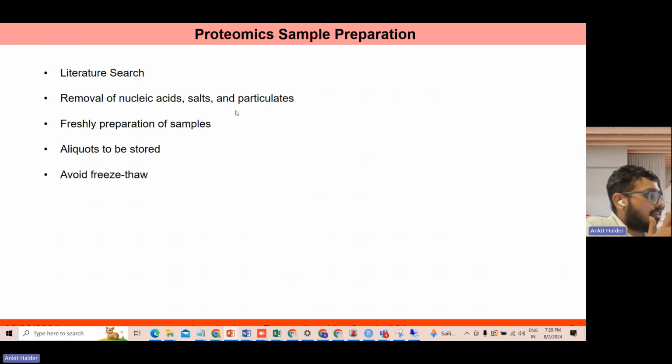As I said, the challenge is not with a regular bacterial sample like an E. coli sample, or any particular tissue you take, but it will be very challenging with, like I said, the rubber plantation or the coffee or tea plantation, which have a huge amount of alkaloids, and you have to deal with the thick cell wall.